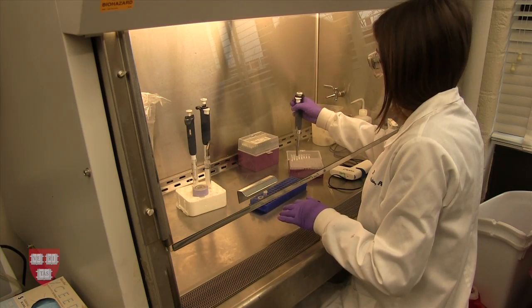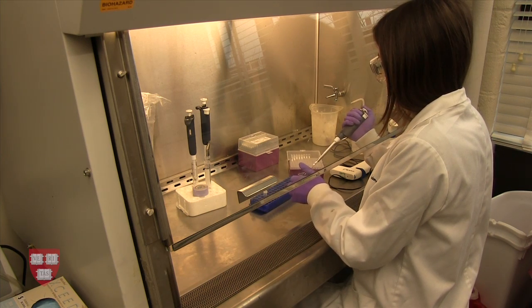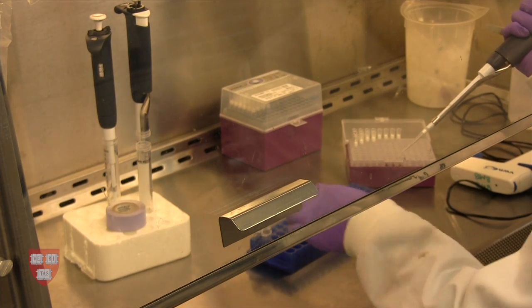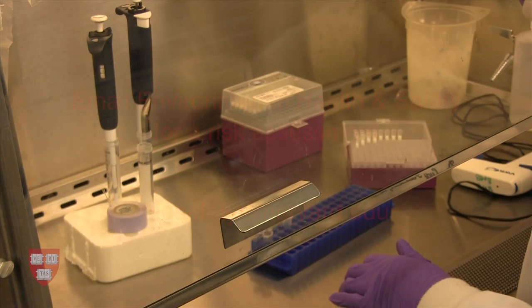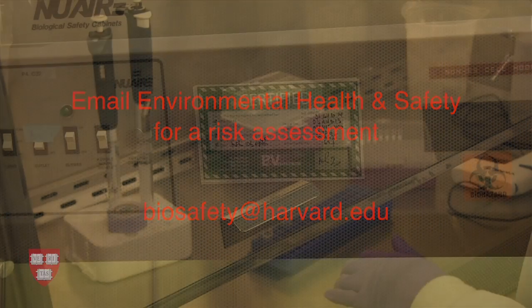There are other types of airflow cabinets, but they do not all provide the same type of protection. For example, chemical work should be conducted in a chemical fume hood. When in doubt, email EH&S for a risk assessment when working with an experiment that involves multiple hazards.